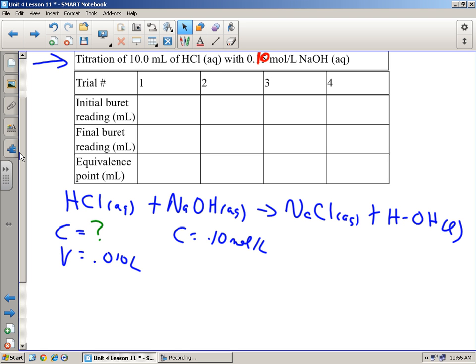And you can just simply pour that back into the one that you used. So I'll give you extra sodium hydroxide, or extra whatever tomorrow, and you can simply pour it back into the same container. Make sure you keep them straight tomorrow. But what happens is, in the tip here, there is no solution at all, because this valve has stopped the solution. So right here at the bottom, there is no solution in there.